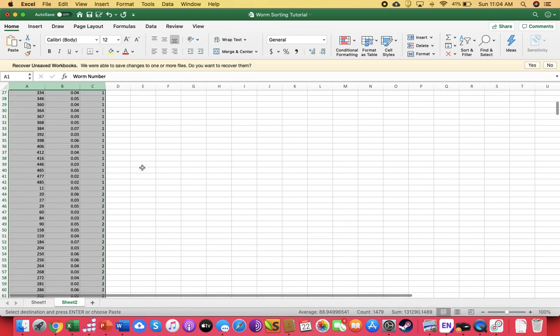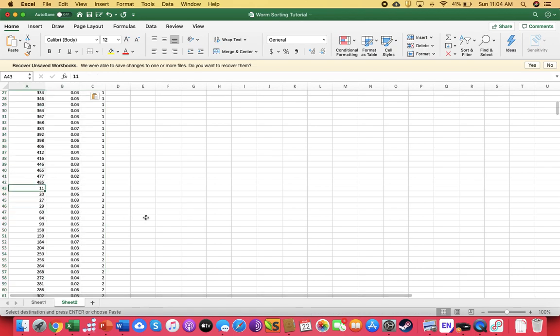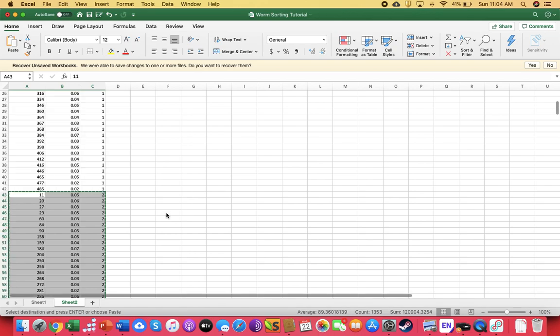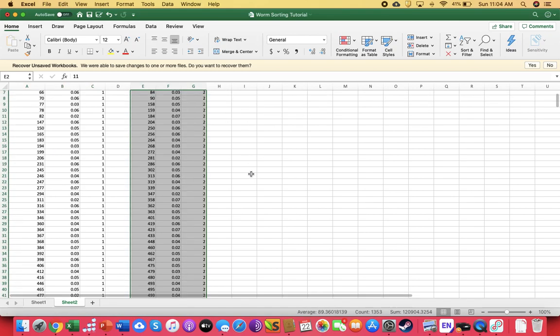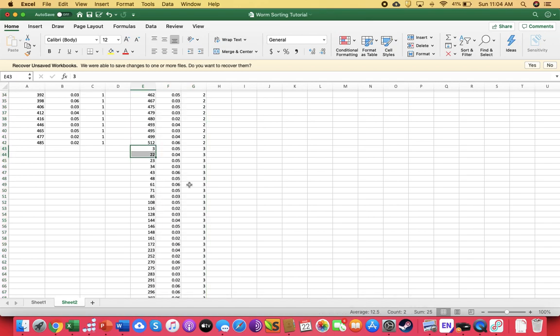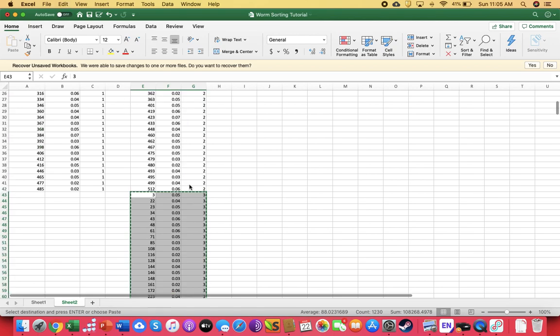All right, at this point I'm regretting that I made so many tanks for you guys, but nonetheless. What I've done is I've copied, and I'm cutting tanks 2 through 12. I'm going to paste them there. I'm going to do the same thing. The reason I'm doing this is because this is how you have to have the data set up to do a statistic.